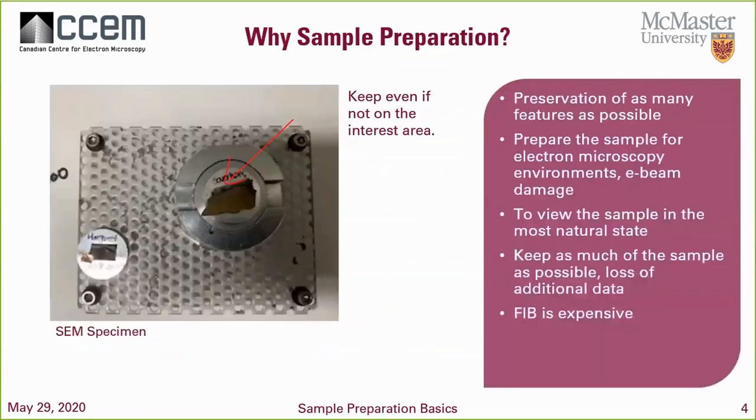Now, why do we prepare samples? Well, of course, we want to preserve as much of the sample as possible. As you can see here in my picture to your left, what I did here is we had a pipe that we had to look at. And what I did was I broke a piece of the pipe, but then later on, I figured that, okay, well, we want to look at what's underneath this layer, right? So what I did is I grabbed a piece of double-sided tape and I took off some of that residue on the top and then mounted it. That way we could see the layer in between.